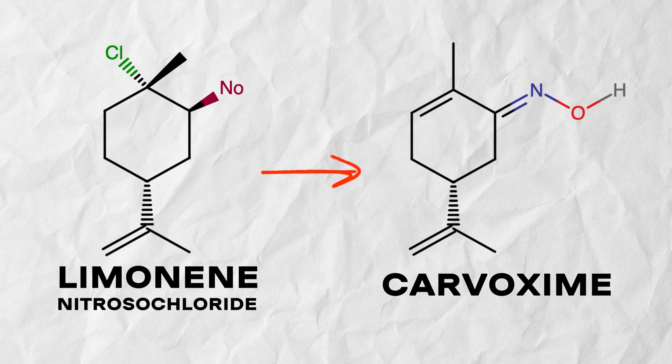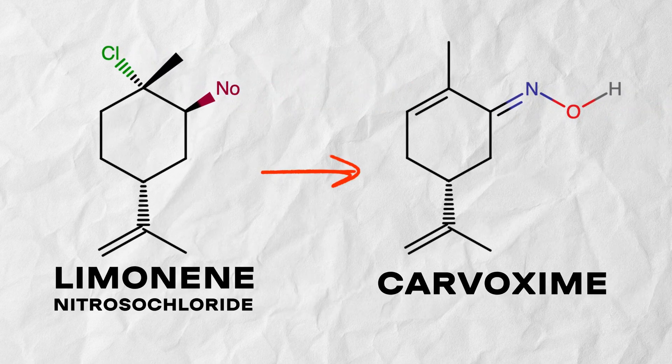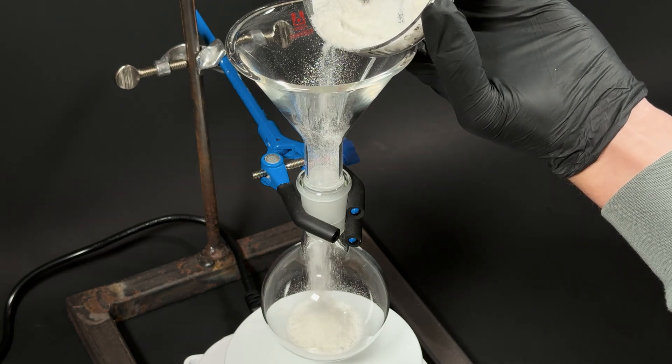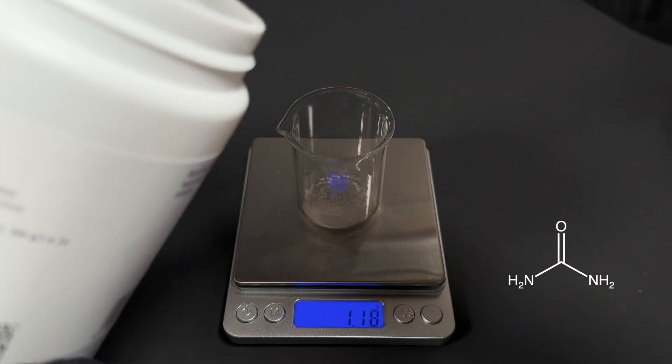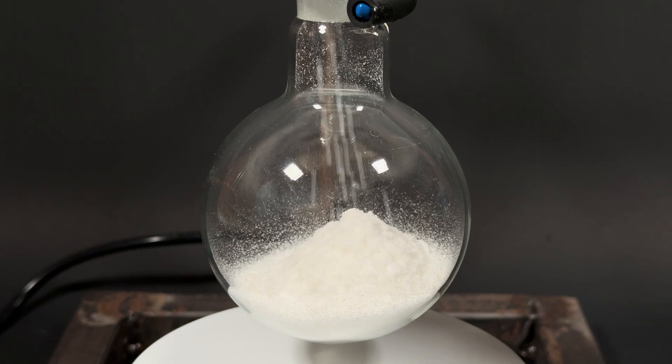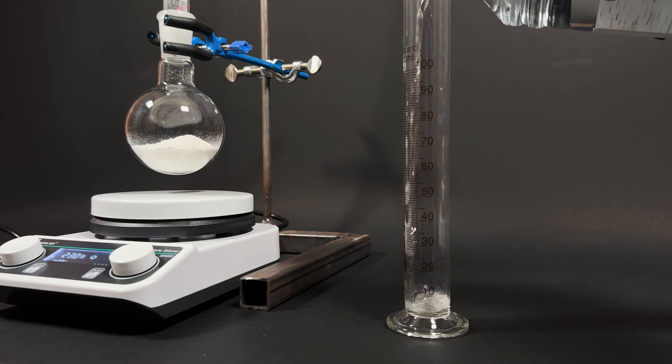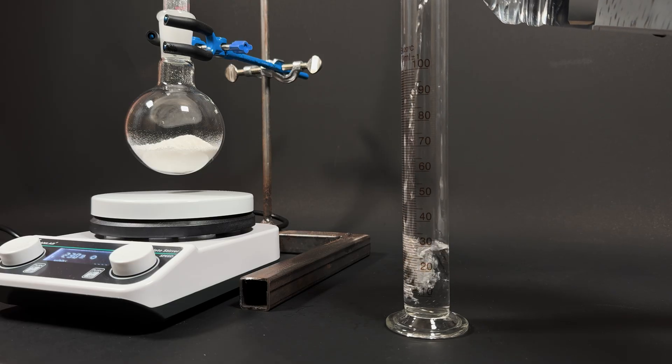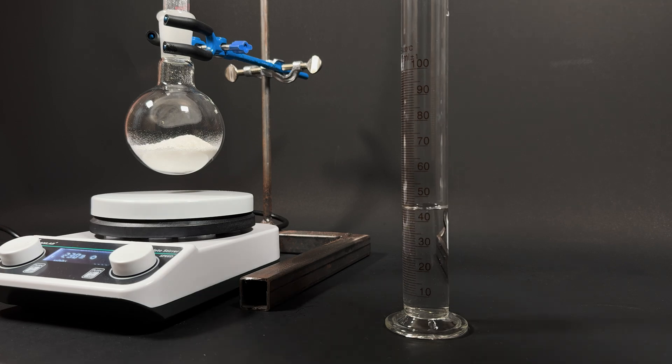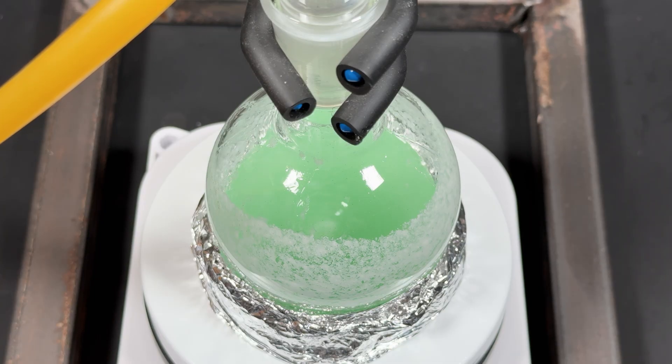Now I've got nitrosochloride. My next goal? Turn it into carvoxime. This reaction is much simpler. I pour the synthesized powder into a flask and add urea. This kicks off hydrogen chloride elimination, turning nitrosochloride into an oxime. More detailed chemistry is in the file below the video. I pour in absolute ethanol. The solution turns bright green almost instantly.